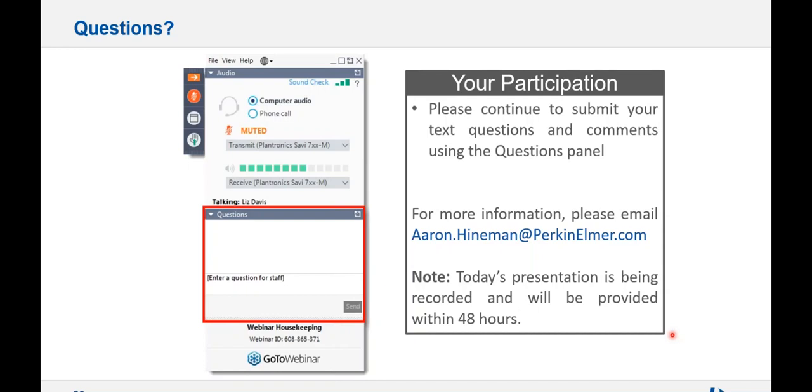That's actually a really good comment. This is a comment, not a question. One attendee says, I usually get 250 to 300 firings for selenium and aluminum determination in blood. So yeah, that's about right. Blood, I typically find, is a fairly complex matrix. There's a lot of carbon and other things in there. 250, 300 firings, that's about right for blood. It's pretty good. And then I have another comment: it sounds like another user is getting around 7,500 cycles on the contact cylinders. That's good to know.